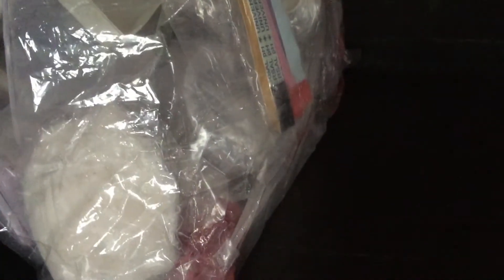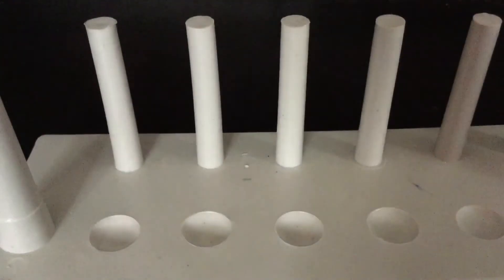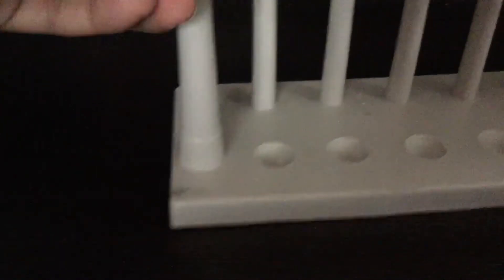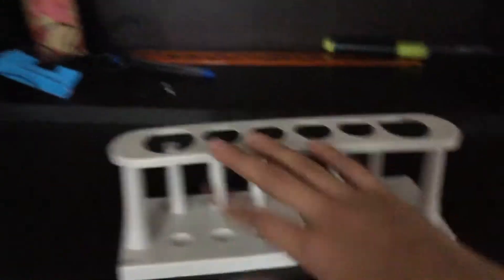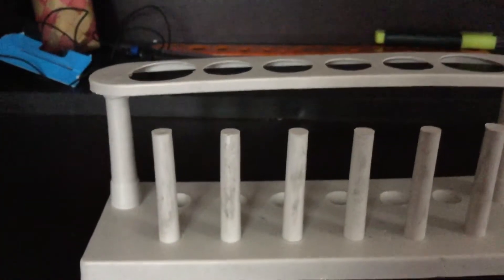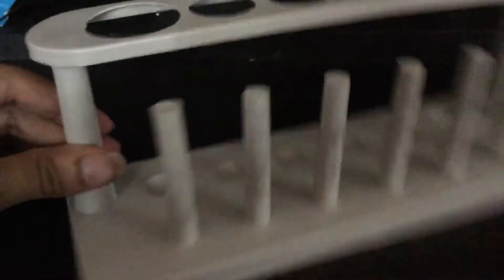We'll take out the plastic items first. This is a test tube, and this is a test tube bracket. It should fit like this — and you can see the test tube fits in like this. The rack is made of hard plastic and is good for keeping the tubes.